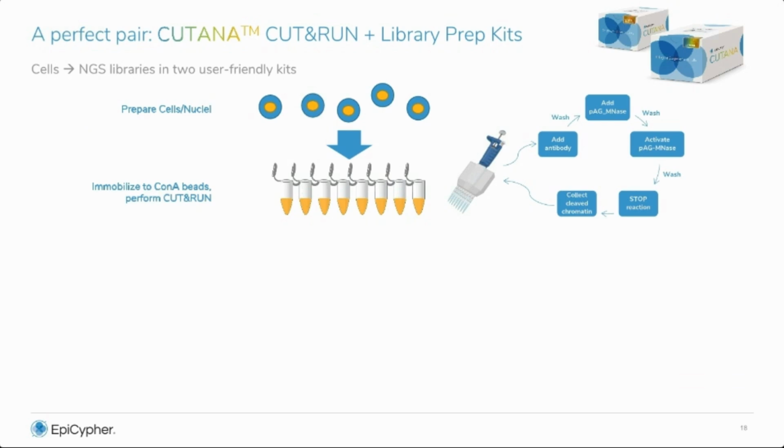So you start out preparing cells. You're usually batch processing your cells unless you have very unique sample conditions. And then you distribute those cells into 8 strip tubes, and you move through the steps of CUT&RUN using a multi-channel pipetter, which enables you to process multiple reactions simultaneously, and your reproducibility across replicates is extremely high, and overall the workflow is just seamless and streamlined.